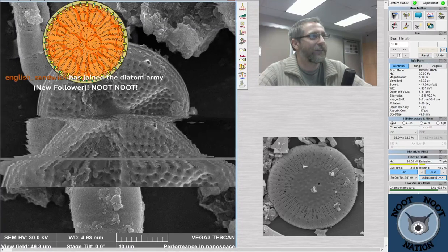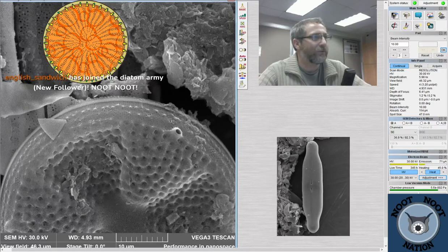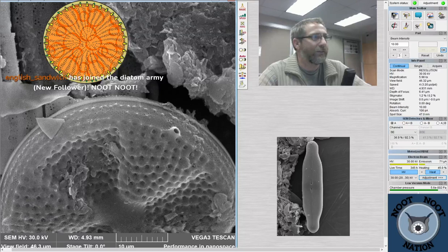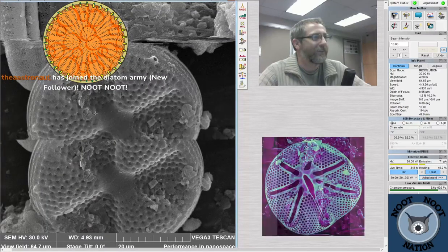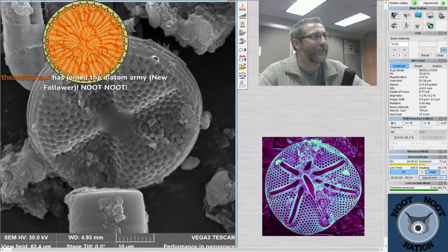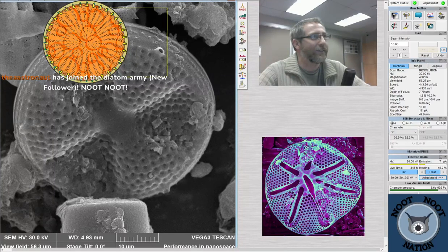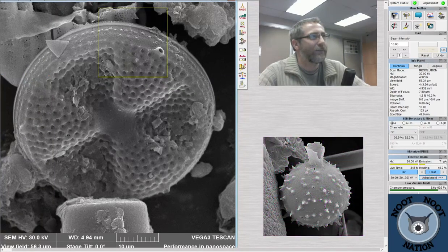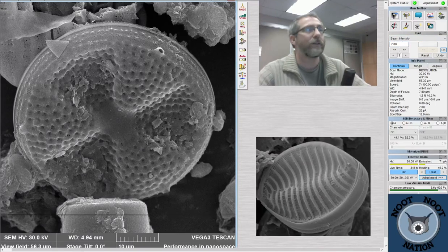I was trying to get this thing in focus. So we're currently looking at some diatom samples from San Francisco Bay. And what I have in the field of view with us at the moment is Actinoptychus, the genus Actinoptychus. As I mentioned, it's sometimes referred to as the radiation symbol diatom. Diatoms are single-celled organisms that are responsible for generating oxygen and being a major food source for pretty much everything that lives in the water.